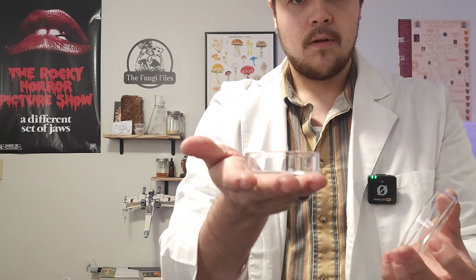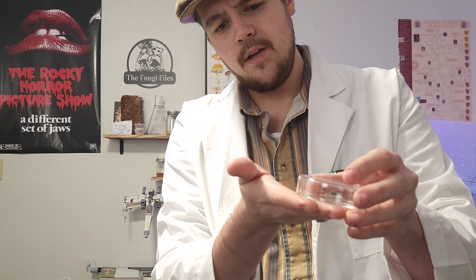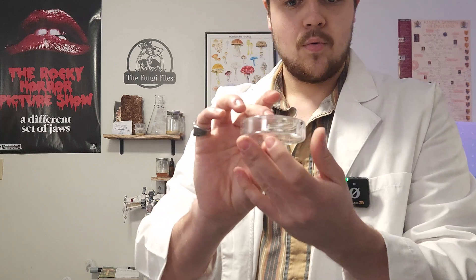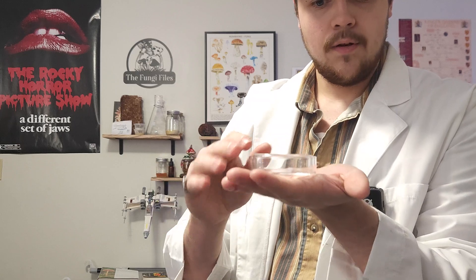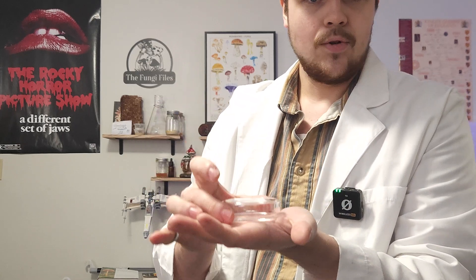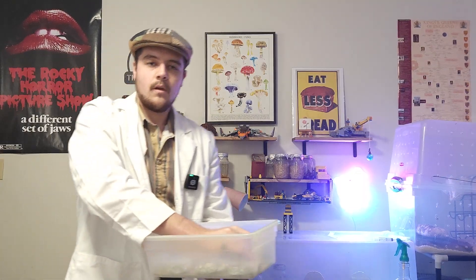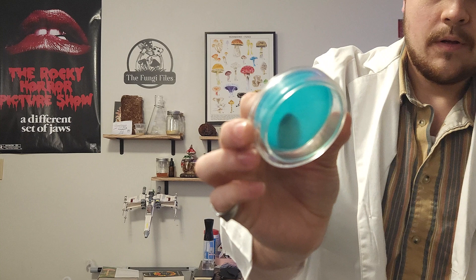If you look, they sit on top of each other — the smaller piece is the bottom. Because of that lip it makes them super inconvenient to pick up. However, for storing them once the agar is cooled, I put them upside down; that lets the condensation fall and seems like the easiest way to actually transport them. They're pretty nice but I haven't worked with them yet for actual culturing, so we'll see how they turn out.